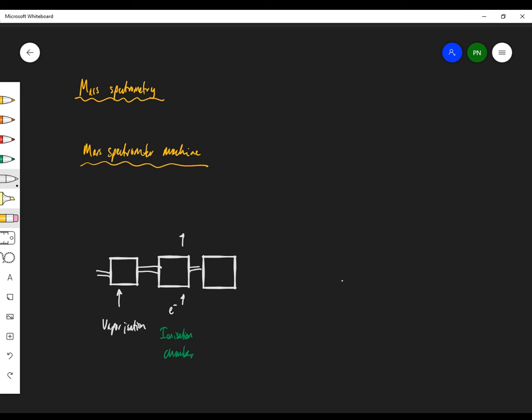After we've charged them, we can bring them into the machine itself. And how do we drag positive and negative things in? We drag them into the machine using an electric field. So this is an electric field, and it zaps the ions into the machine. And they zoom along in the machine. Then we pass the ions through a magnetic field. So this thing represents a magnetic field.